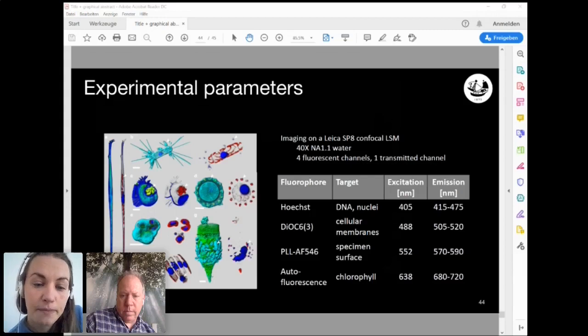Is the image acquisition taking you a long time, or is it the classification that's taking the longest time? Both of them. So you can run them in parallel, so one doesn't get ahead of the other. Yeah, they are both long. Let's say, I don't know, for these 4-well, 8-well plates, a day.